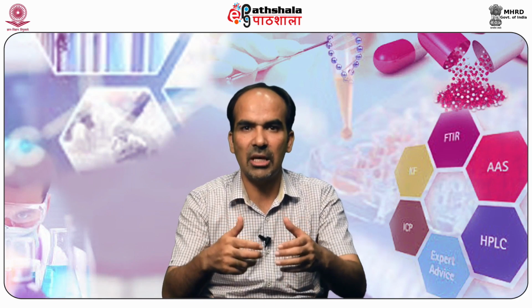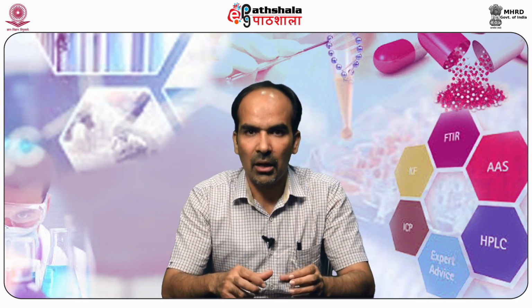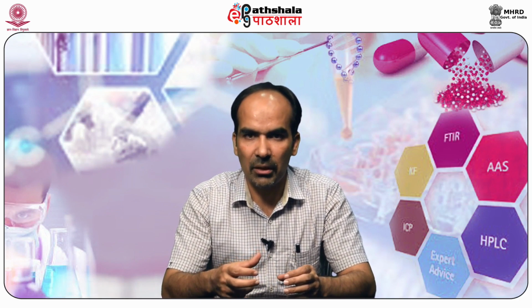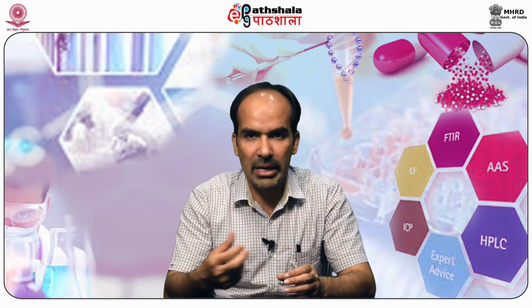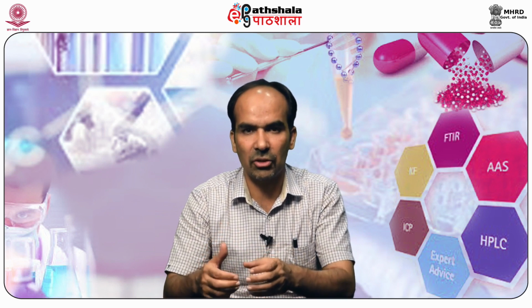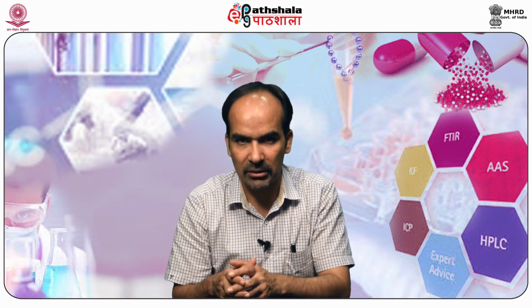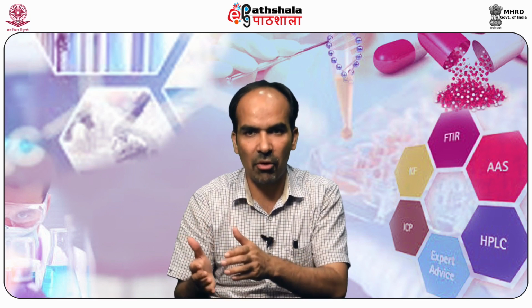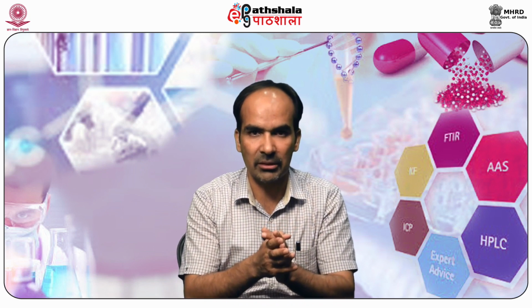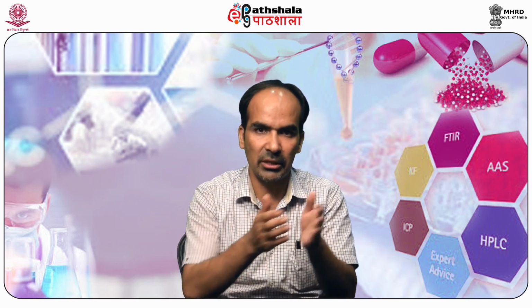So students, let us now summarize what we have learned from this module. Absorption in the UV, visible, IR or near IR regions of the electromagnetic spectrum is the basis of spectroscopic analysis of several natural products. They also provide key information about the structure of natural products, so they can be used for the determination of structure as well as for detection in some of those matrices.